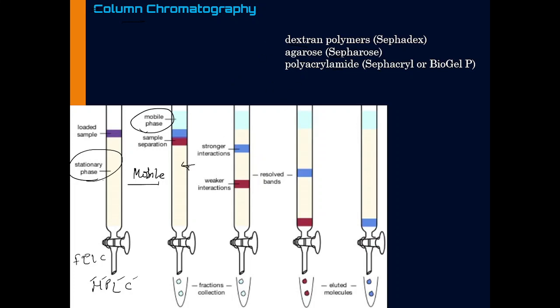First, you pack your column. Sometimes this is also readymade, available with different pore sizes, depending on the protein you have. You add the solution. How to isolate the solution, we will deal with in part 2. Let's say you have added the protein solution and loaded it into this column. What happens now? There are large molecules, and there is a possibility of small molecules.